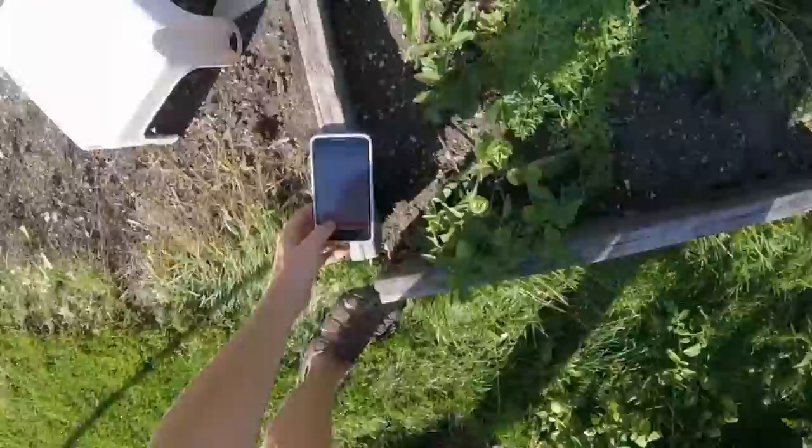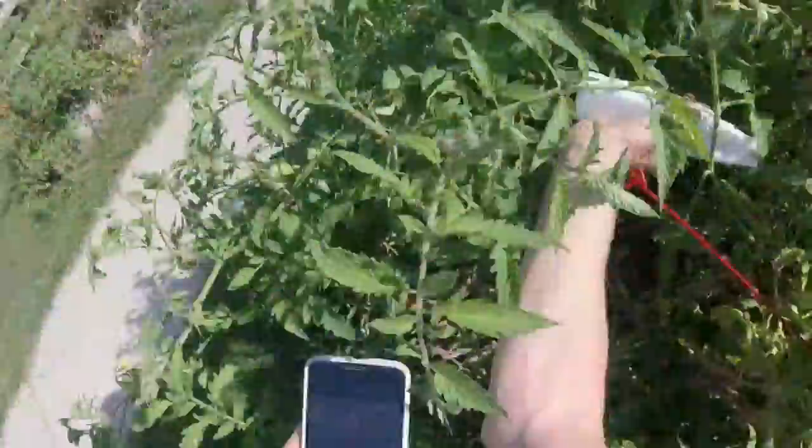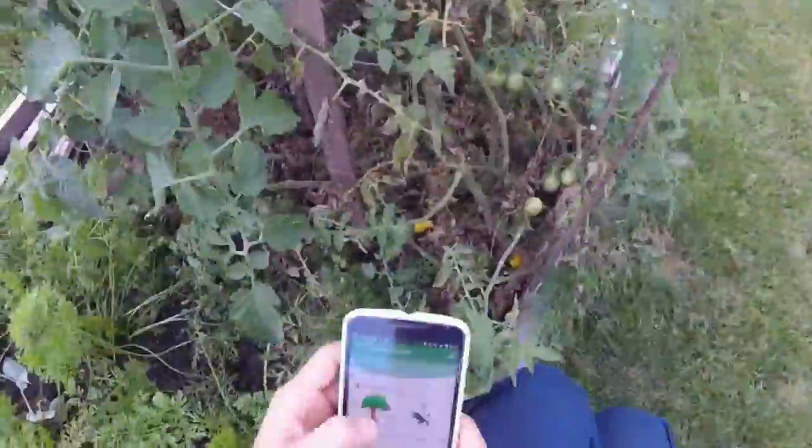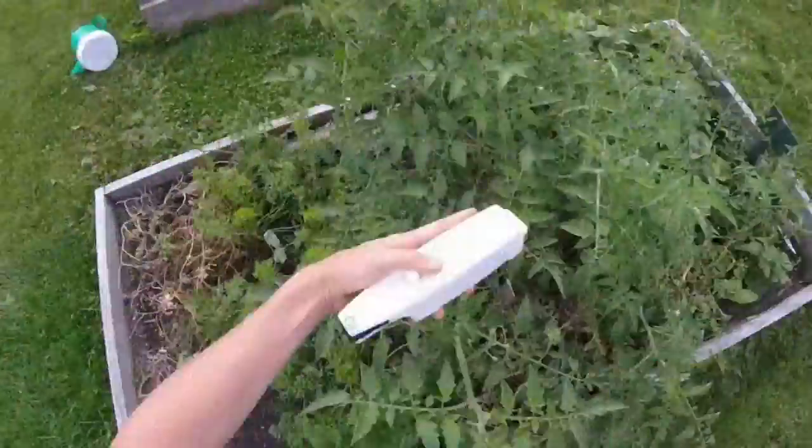If you're taking images for each leaf, you can collect about 50 measurements per hour. If you're not, you can collect closer to 80 measurements per hour. Pretty fast.